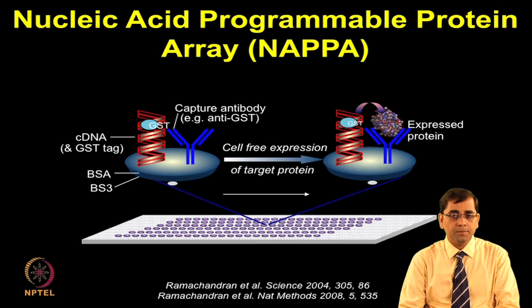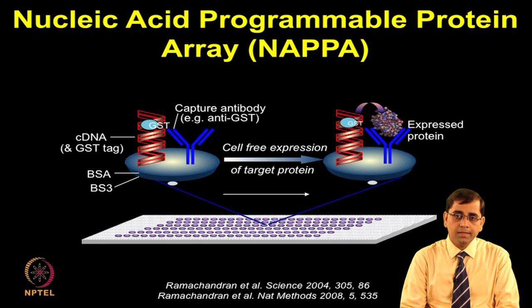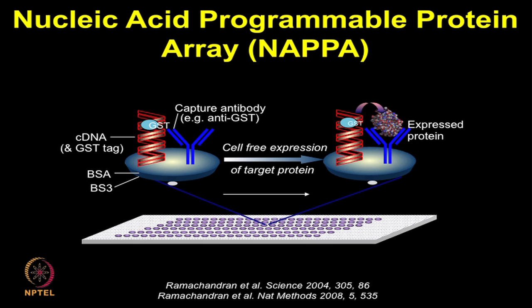The cell-free expression system has eased the path of fabricating arrays and has been widely commercialized by different manufacturers such as Promega, Thermo Fisher, New England Biolabs, Takara Clontech, etc. The cell extracts of wheat germ cells, rabbit reticulocyte lysate, E. coli cells and insect cells have shown great promise for in vitro translation of proteins from the template DNA.